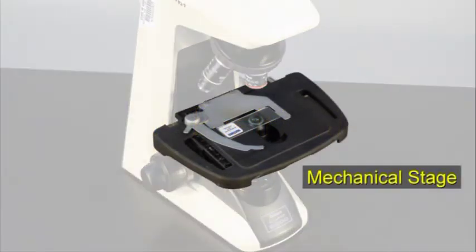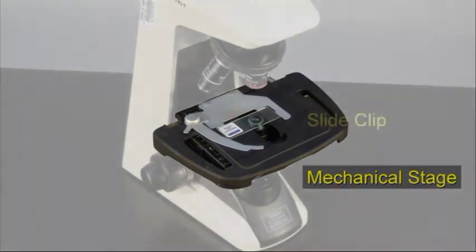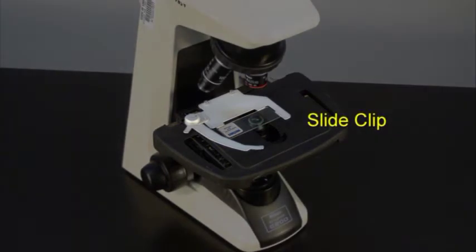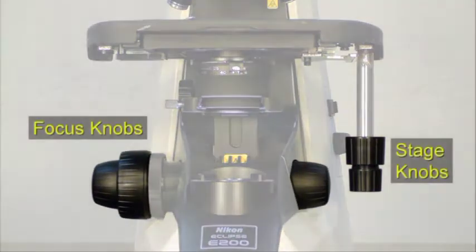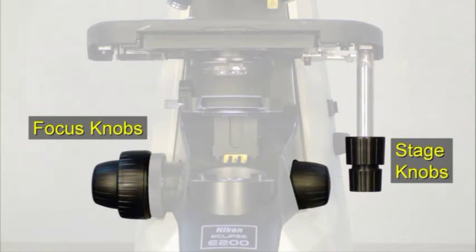The mechanical stage supports the slide and positions it so you can view different parts of the specimen. The slide clip secures the slide to the stage. The mechanical stage has four adjustments, two stage knobs and two focus knobs.